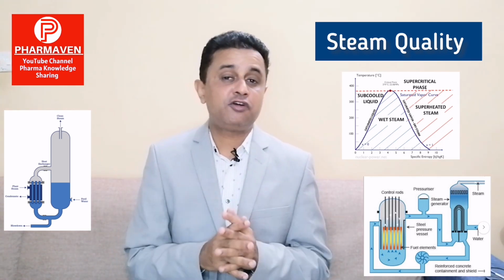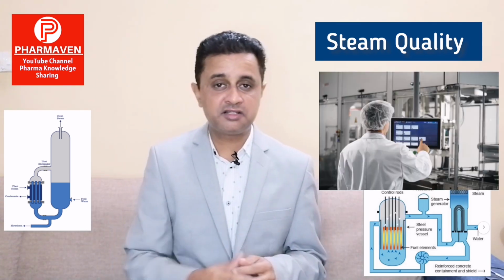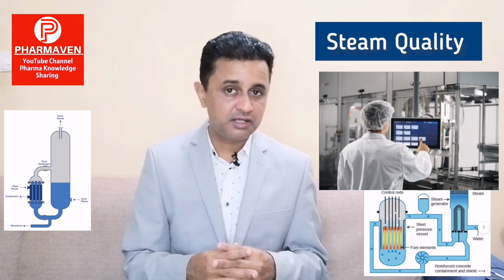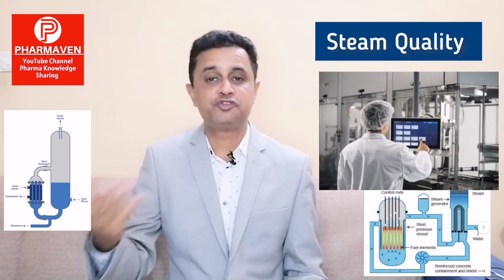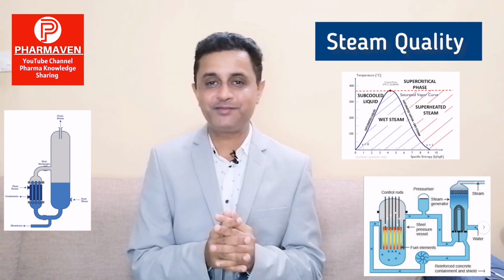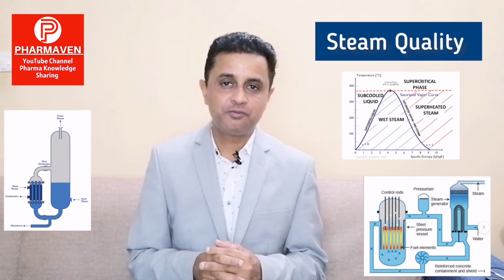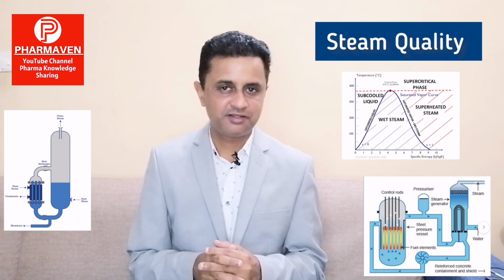And of course in your entire investigation you must involve the operators who are running the steam sterilizer as well as the supervisors who are placing the loads. That way there will be ongoing training and awareness for them on what to investigate and how to investigate a BI failure when such failures occur in future. We wish that there should not be any failures, but if they occur we must investigate. So I hope this small video will help you to understand and do a proper BI failure investigation in your autoclave.